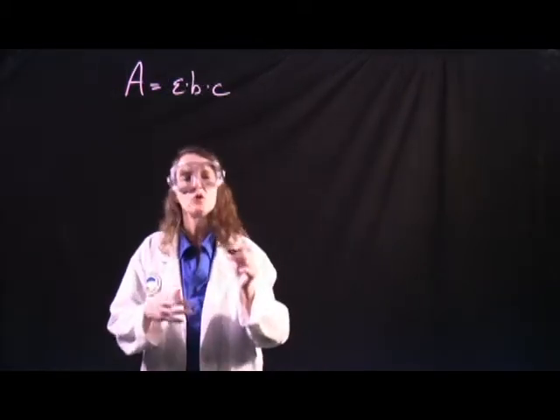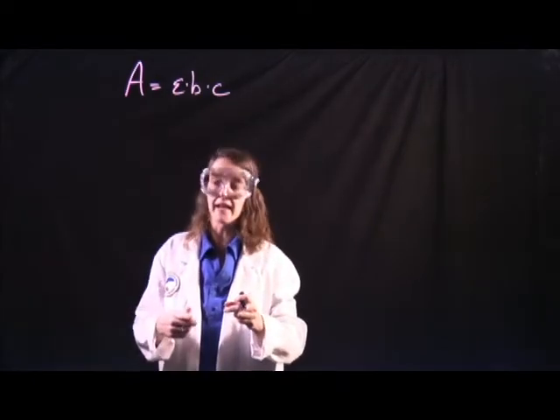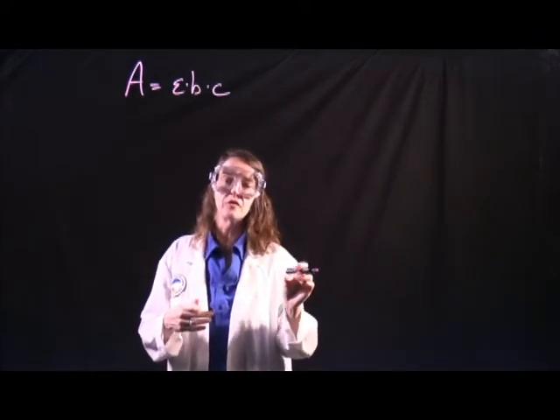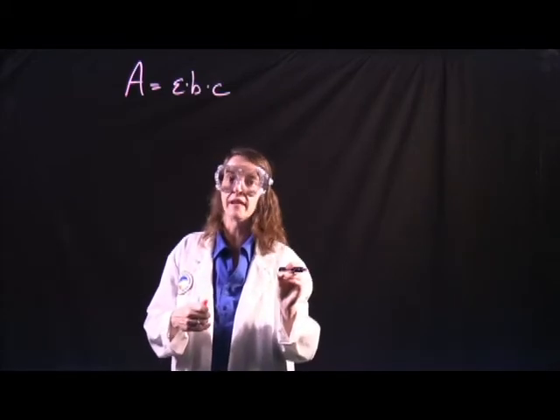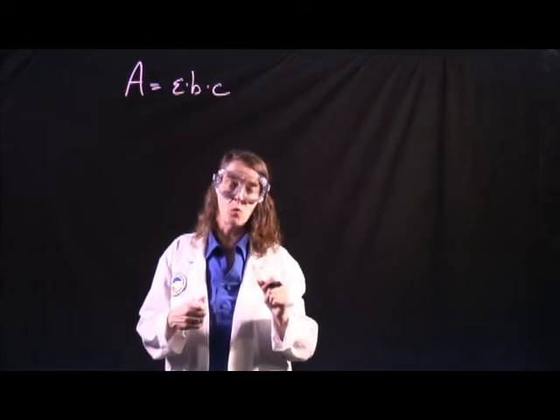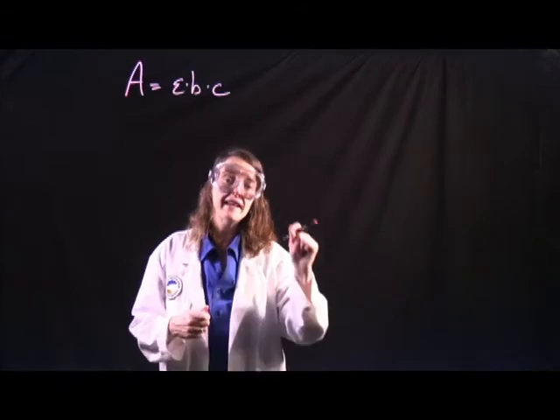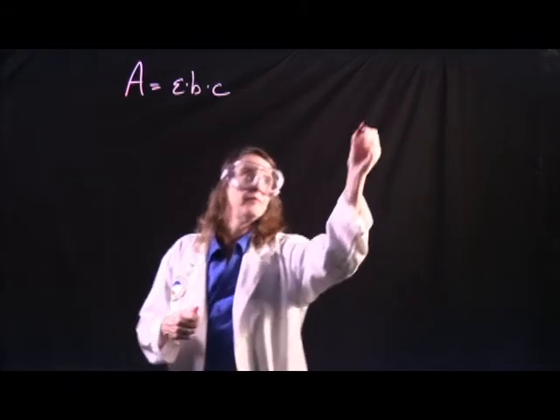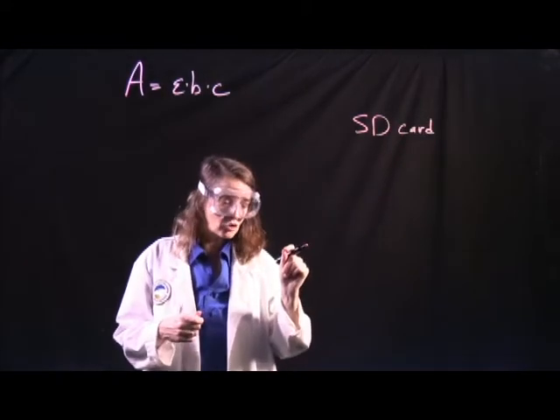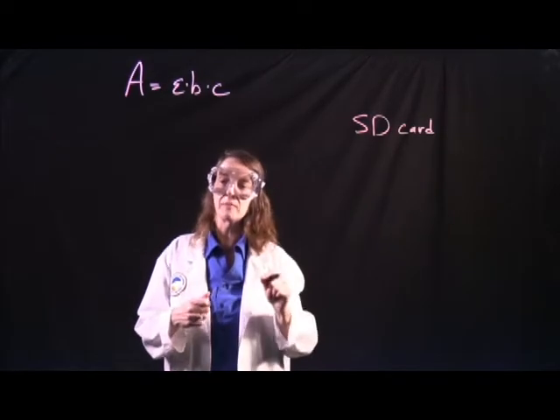I'm not going to go into a lot of details regarding exactly how to gather the data. There are a lot of written instructions in the lab manual for that, and your instructor will talk to you more about that in lab as well. There is one important point that I want to bring up here. The experimental conditions are on the SD card of the LabQuest device. So the instructions tell you to open the file on the SD card. That's where the experimental conditions are.